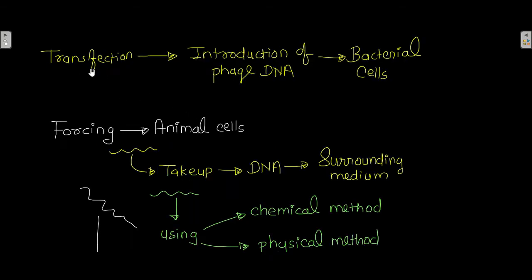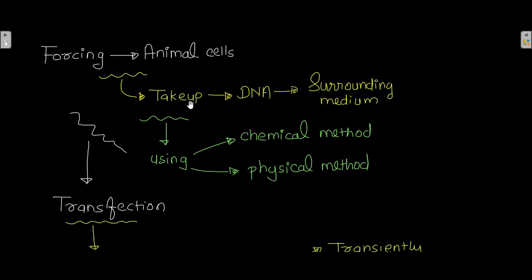Now, the term transfection was originally coined to describe the introduction of phage DNA into bacterial cells. Similarly, forcing animal cells to take up DNA from the surrounding medium using various chemical or physical methods is also termed transfection. Transfection is all about forcing animal cells to take up DNA from the surrounding medium using chemical or physical methods.